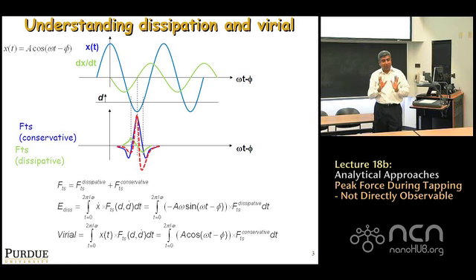This is a very important issue because I think there is probably no paper out there that makes a distinction between sine of phase and cosine of phase. Everybody, when they talk of phase contrast, first of all, I already showed you, most people don't even care or bother to say if it's phase lag or phase lead, which is so essential. You know, if you get a bright or a dark surface, how do you know which is more dissipation, less dissipation?